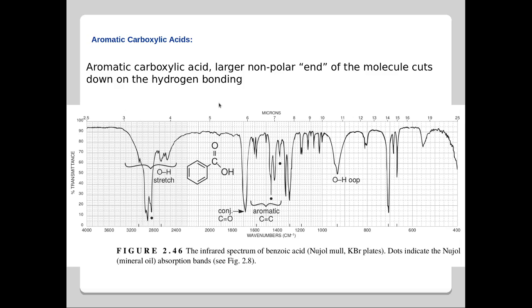So this one is a spectrum of an aromatic carboxylic acid functional group, where the carbonyl functional group is bound to a phenyl ring system here, so that there could be effective conjugation between the carbonyl pi bond and the pi bond structure of the phenyl system. Okay, and which reduces the carbonyl stretching frequency to a lower value, and that appears to be at around 1680 centimeter inverse.